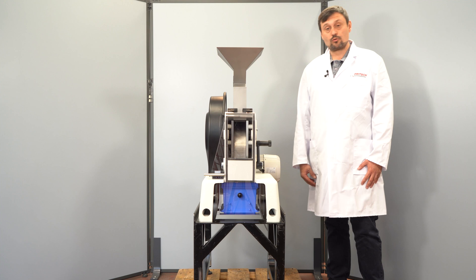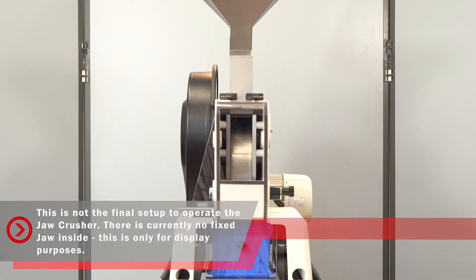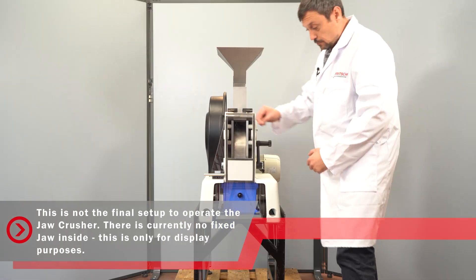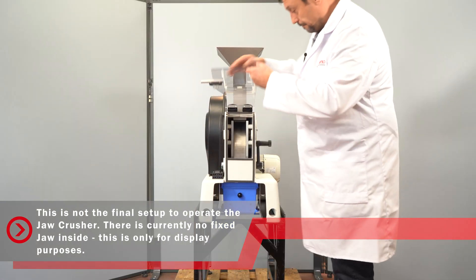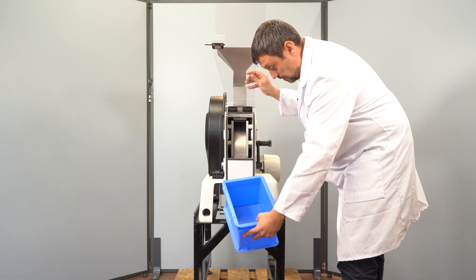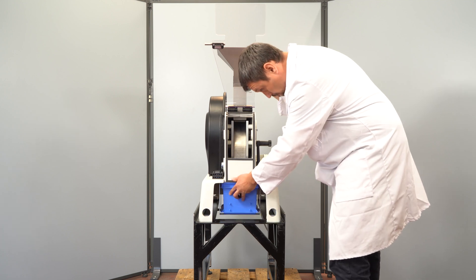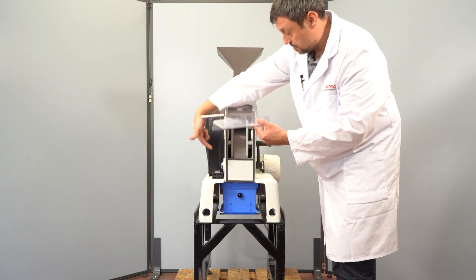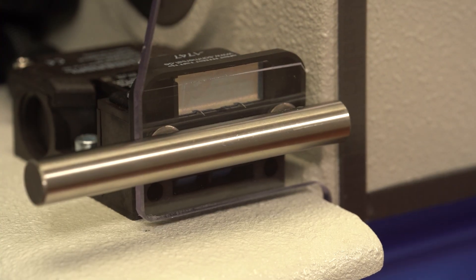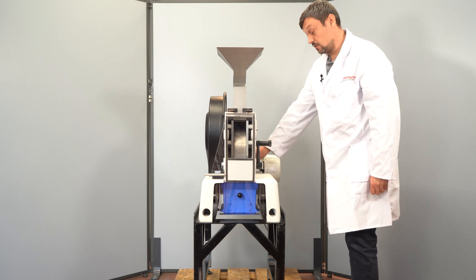Before we start the instrument we can check the Pulver Resider 1 Jaw Crusher. We have the collecting vessel for the ground sample in here. We have a safety switch here, and we cannot run the instrument without closing the safety switch.